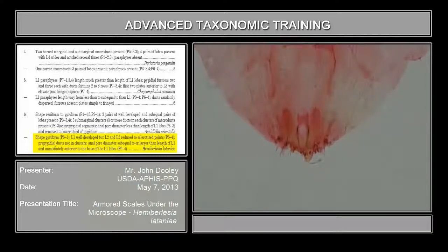This is specific for Latania scale. For information, they did DNA studies on this. This is one of the species where it is both parthenogenetic within the species depending on the population — some have no males and reproduce without males, while others reproduce with males and females. It's really interesting.